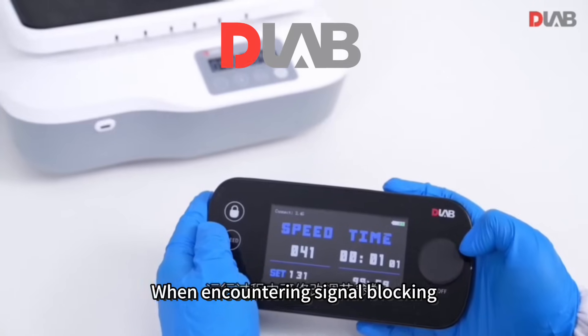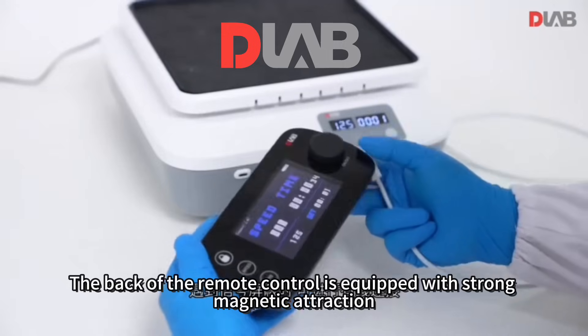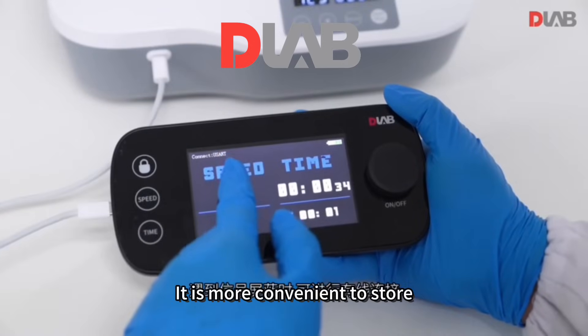When encountering signal blocking, a wired connection is possible. The back of the remote control is equipped with a strong magnetic attachment, allowing it to be placed on the outer wall of the incubator or any metal surface for more convenient storage.